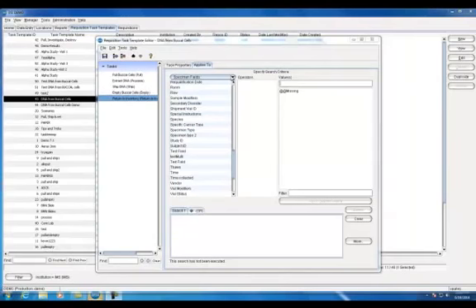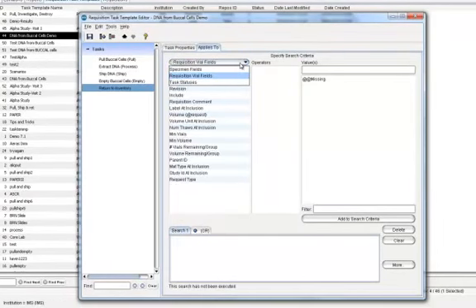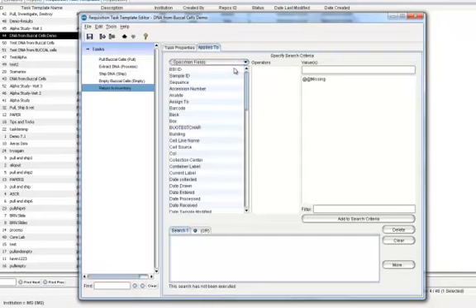I want to apply this task to all remaining reserved specimens, so I will enter a criterion of vial status equals reserved. However, since a task is never unapplied using task templates, I will have to unapply the task for empty and out specimens in the requisition. Notice that I can create applies to criteria based on specimen fields, requisition fields, and task statuses. For this process, I simply want to apply the task to specimens that are reserved.